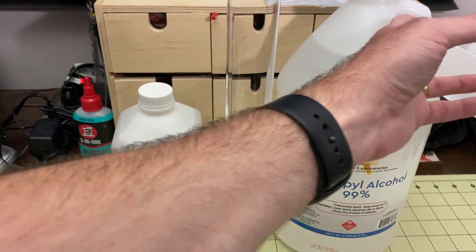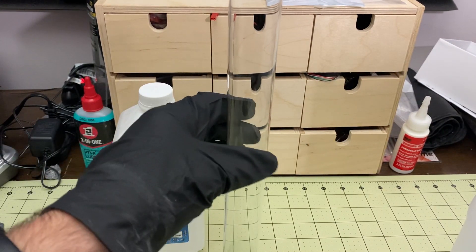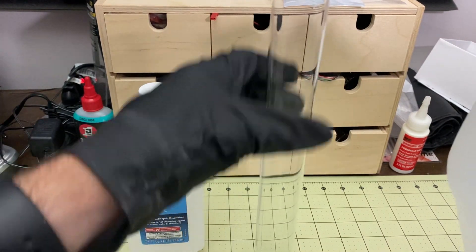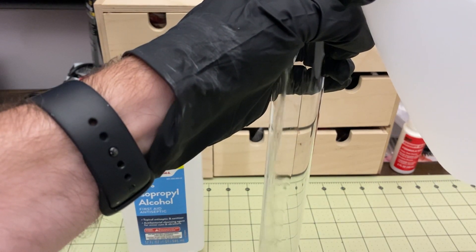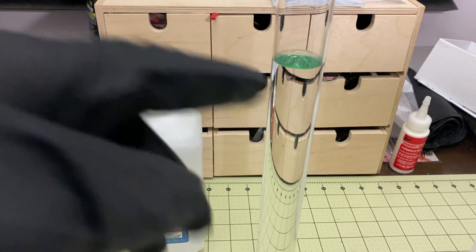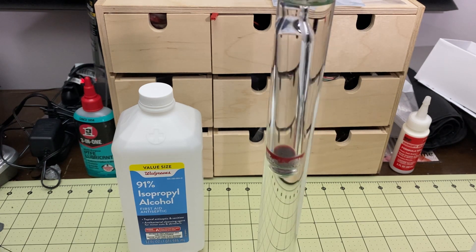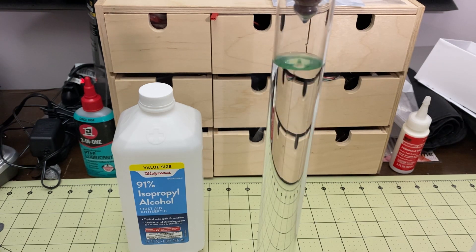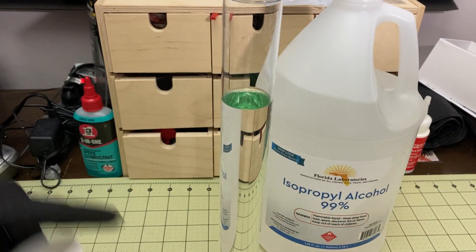I'm putting on gloves for this because this stuff is nasty — I don't want to make any contact with it. We'll just pour this in here. You could use a funnel but the opening is large enough that it's not really a problem. Now all we have to do is take the hydrometer and drop it in here — except I did fill it a little too far, so it's not going to quite fit. Whoops.